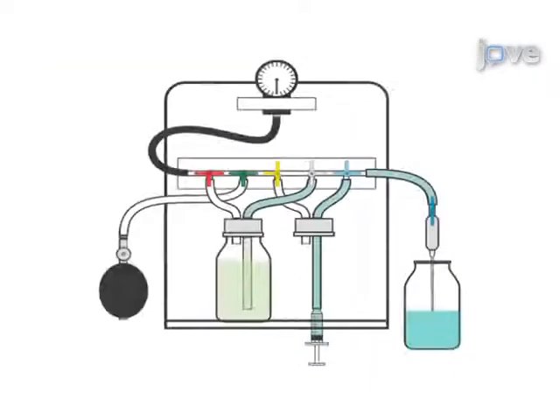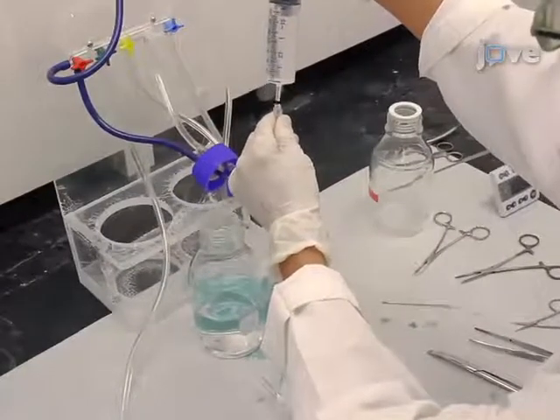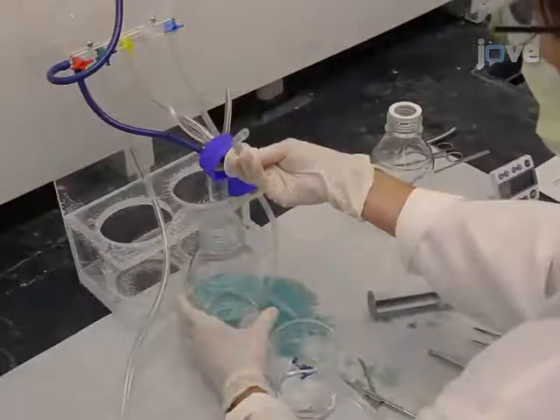Now turn the exit valve off. Then remove the tube from the syringe while squeezing it so a drop of buffer hangs from the end. Place the filled tubing — the fixative inlet — into a bottle with 200 ml of paraformaldehyde.